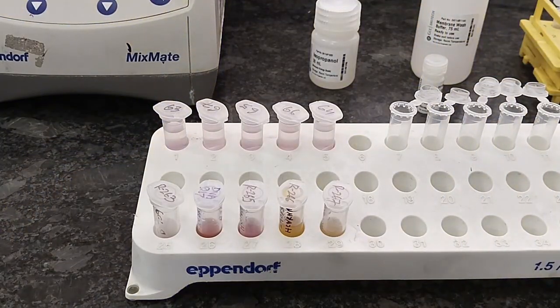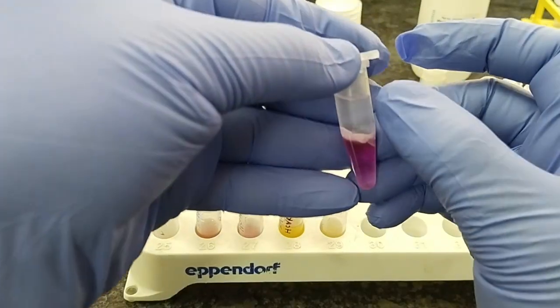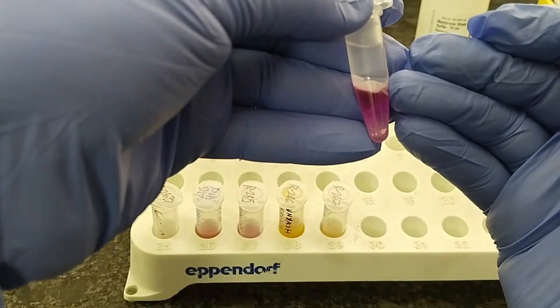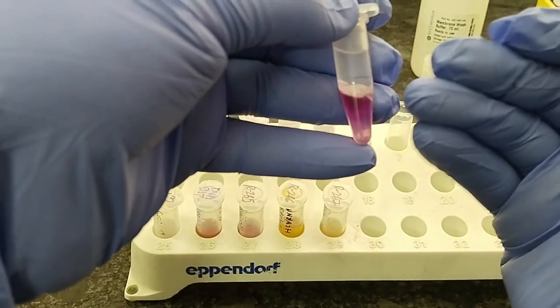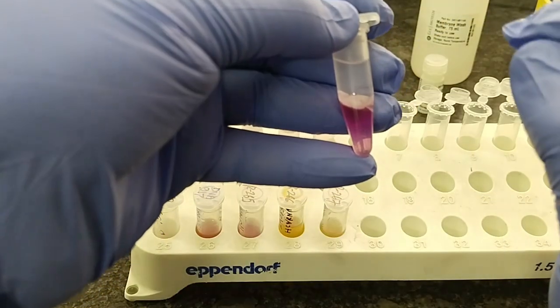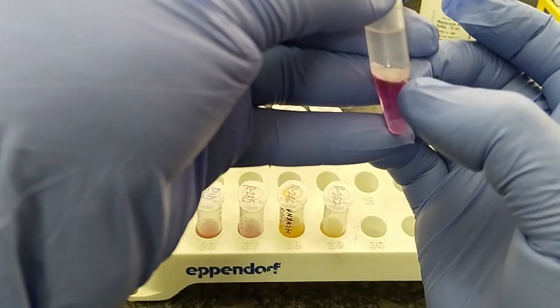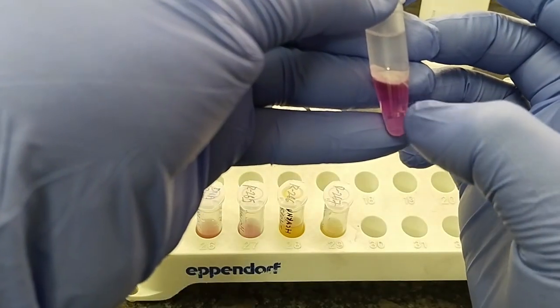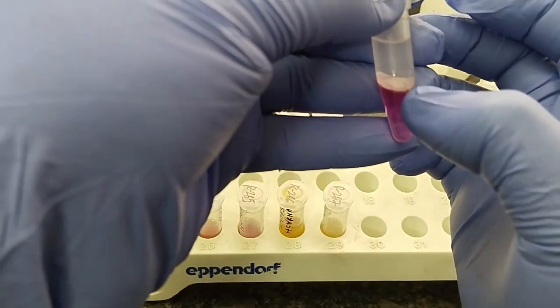One thing I forgot to mention is that chloroform enhances the phase separation. You can see the phase separation. The first one is the aqueous phase, the second one is the interphase, and the third and bottom one is the organic phase. So this phase separation is enhanced by chloroform. All protein stays at the bottom, deposited in this phase.